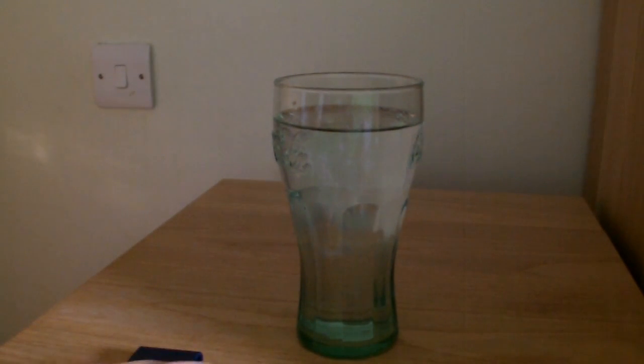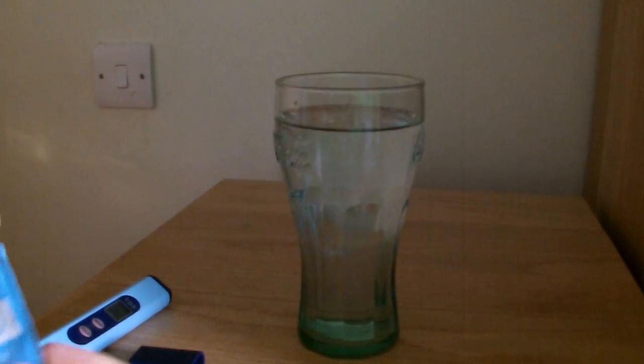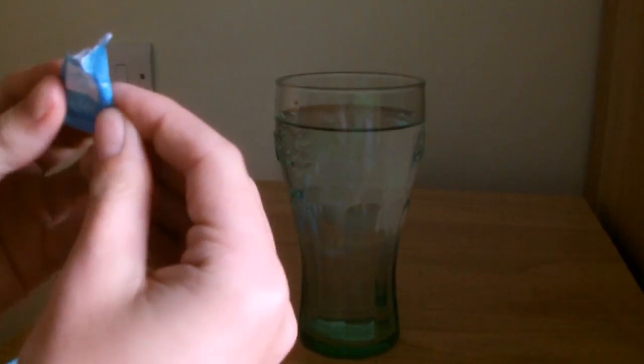Interestingly, this is the upstairs water. When I tested it downstairs it measured at 150 parts per million, so somewhere 20 parts per million is being added. Might test again. Anyway, just to prove that it is working, what I'm going to do is add some salt. Obviously salt is soluble so it will become as one with the water as it dissolves.